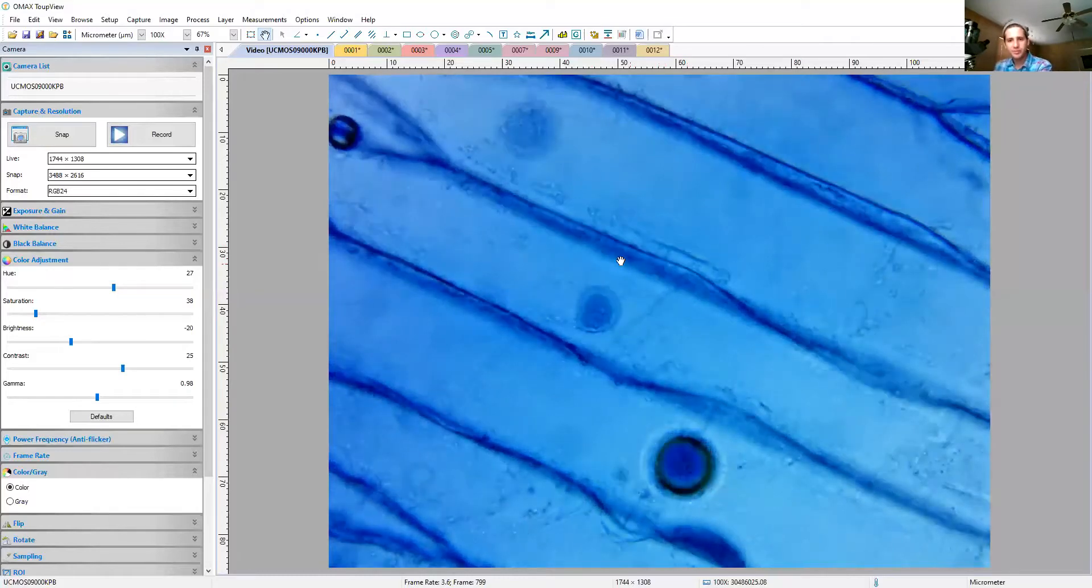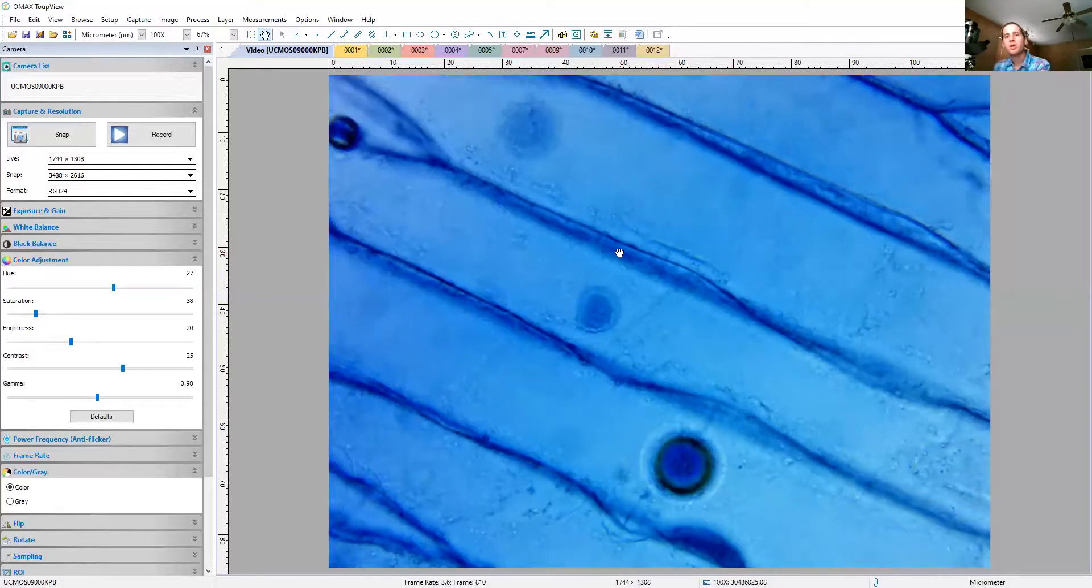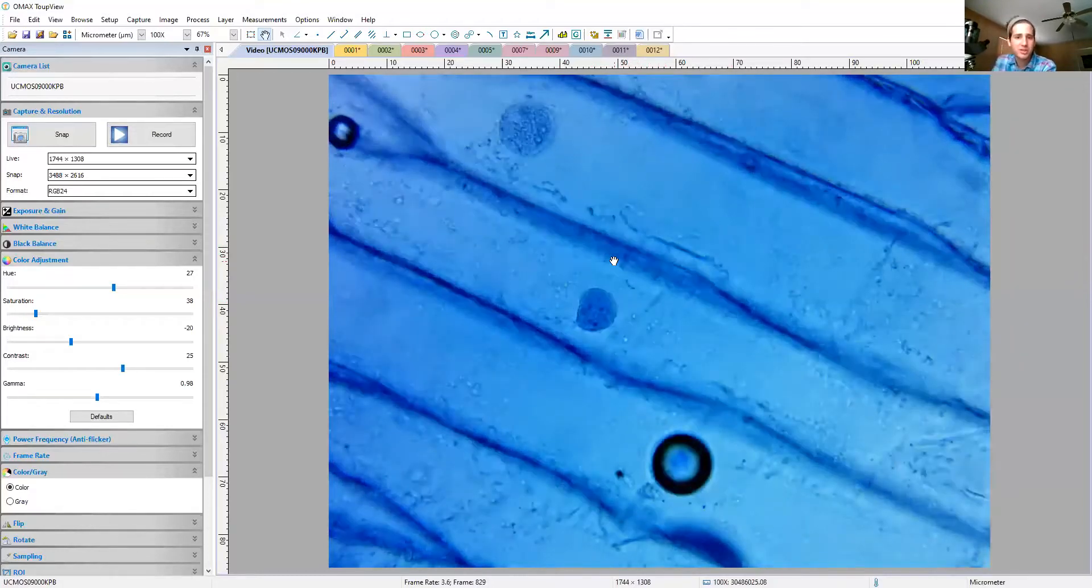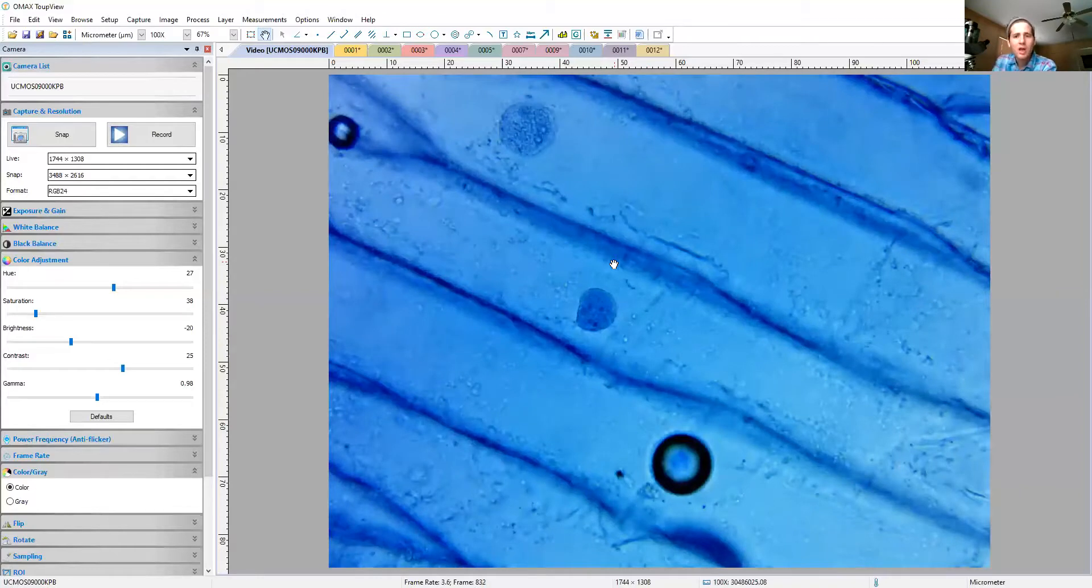But these lines that you see, those are the cell walls. We can't really see the cell membranes for this particular specimen, but we would know that they're going to be on the inside of each of these cells.